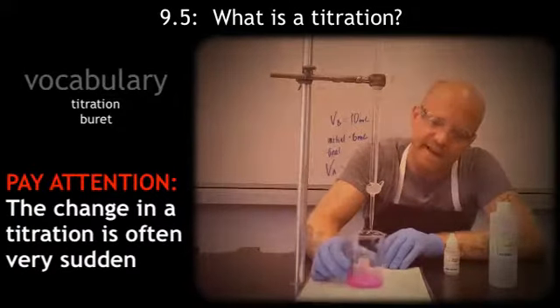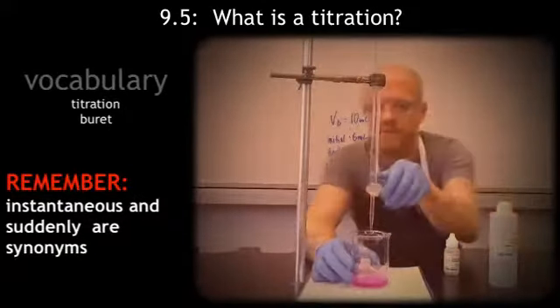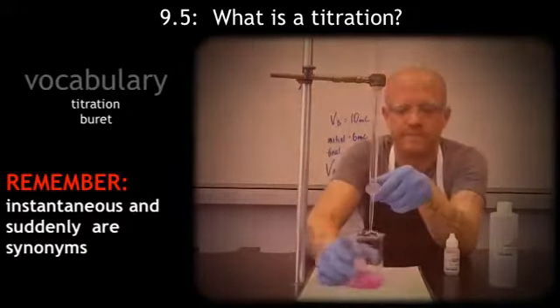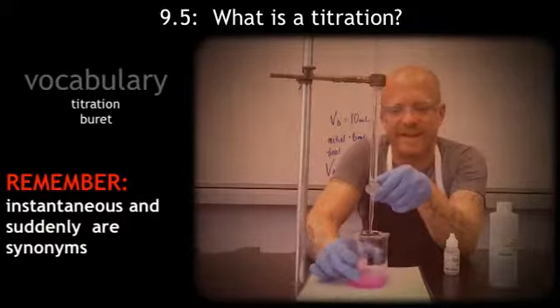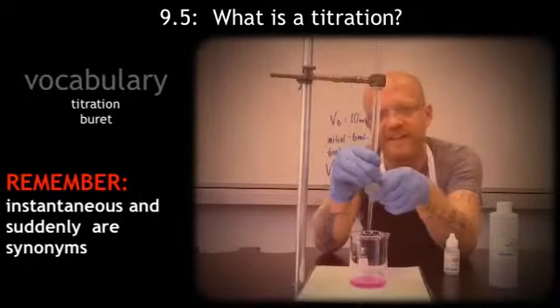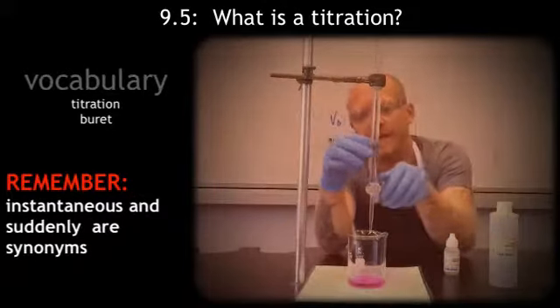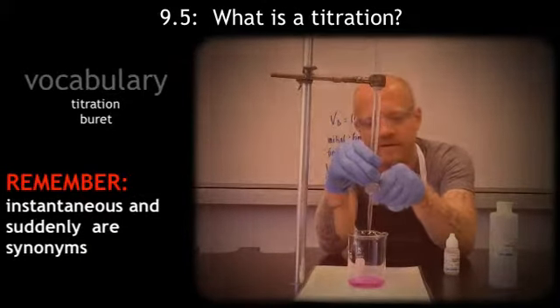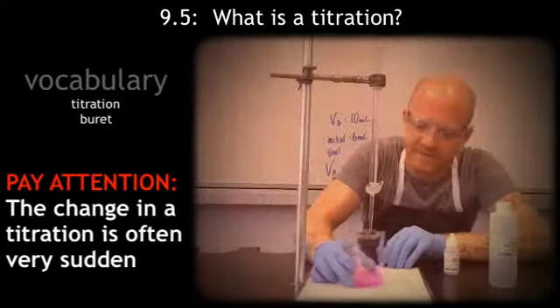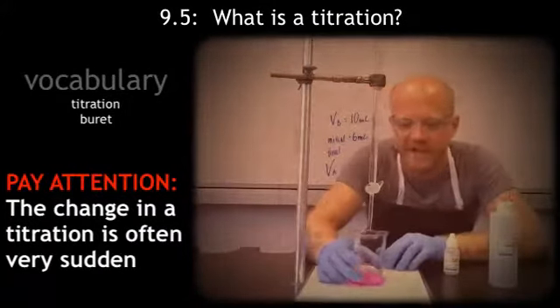When it changes, it'll be instantaneous. It's going slowly. Might have to open it up a little bit. See, it's starting to get lighter, which means it might be in that range. Phenolphthalein is one of the indicators that we use to find out a neutral solution. So it's going from a darker, deeper pink, or fuchsia, into a lighter, more translucent pink. And once it becomes straight colorless, I will have noticed my change.